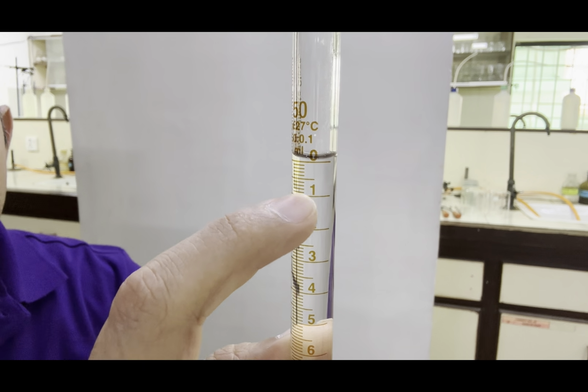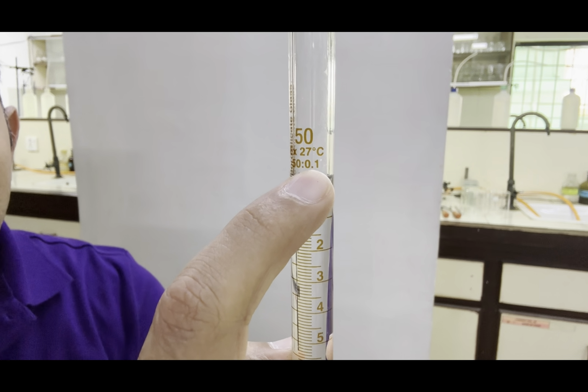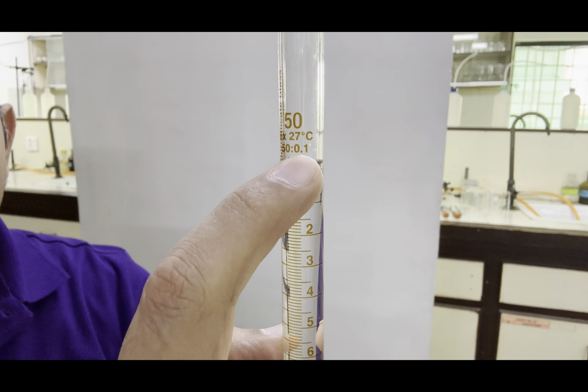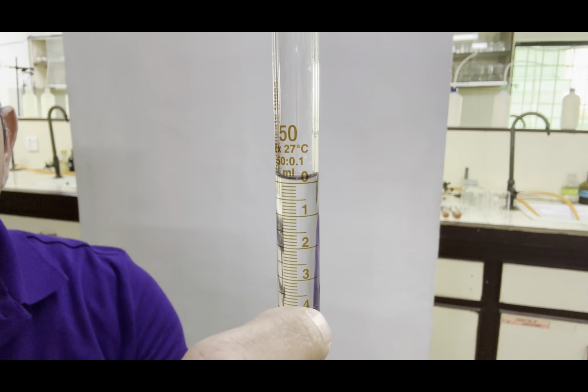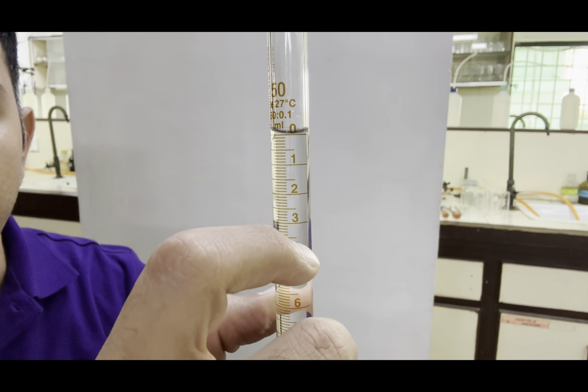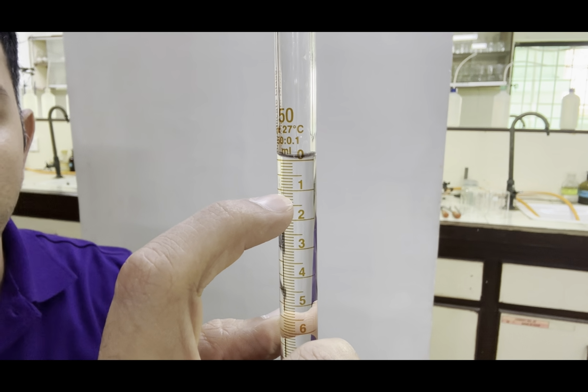Therefore, the least count of this burette, 0.1, divided by 2, we will get the error, that is 0.05. So all the burette readings will be recorded up to 2 decimal places. In this case, we will record the reading as 0.00.